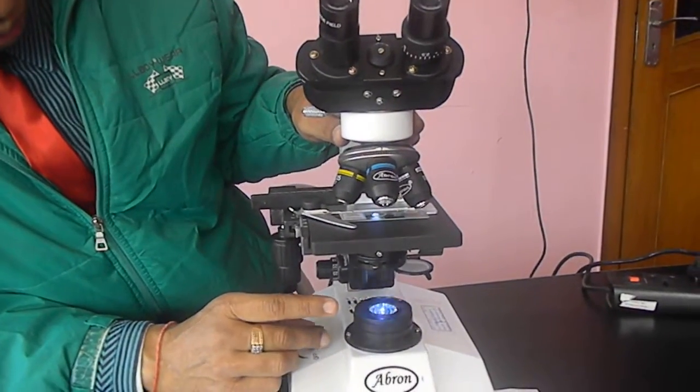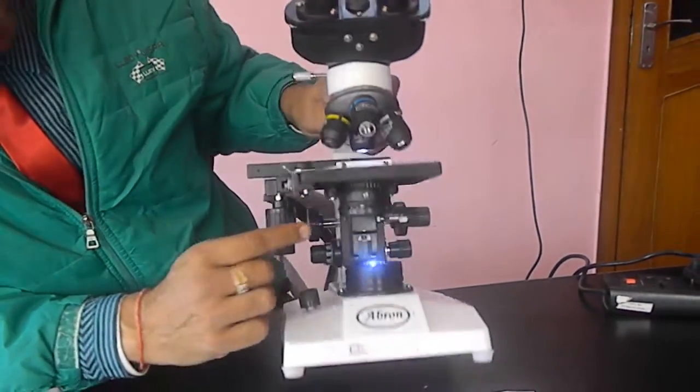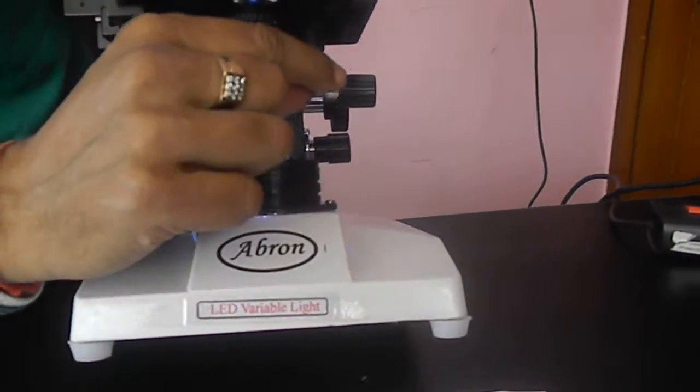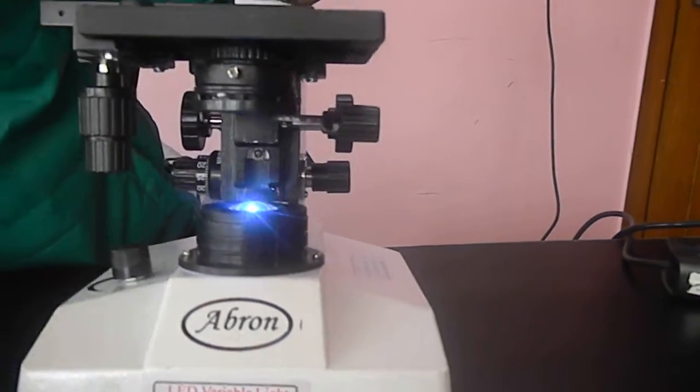Switch on the LED, put it to the maximum, and there is one condenser light. You can remove this blue filter. You can put it on one side so that the maximum light goes up.